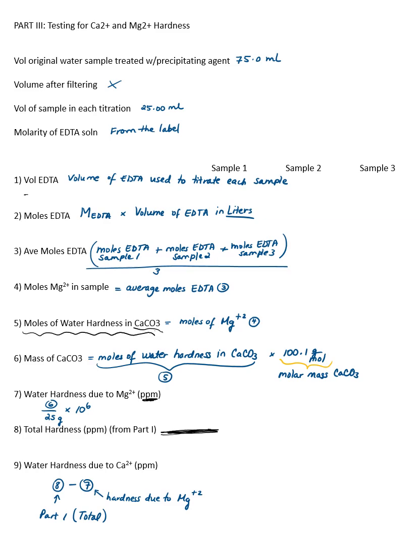calcium carbonate, amount of calcium carbonate, but since magnesium and calcium carbonate, the relationship is 1 to 1, we can assume that that's a total. It's a calcium carbonate because we're using those grams, but we have the magnesium and the calcium all together. So for these titrations, you have only magnesium. We converted that also to calcium carbonate to have the same. So when you do the total minus this one here, which corresponds to magnesium, right? You're going to get the one that is due to the calcium ion in solution.